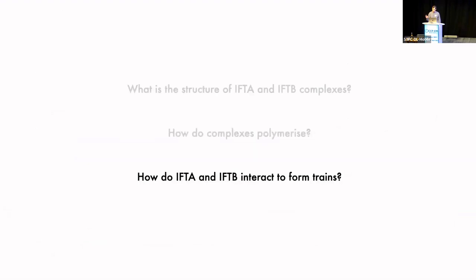Okay, so that is sort of what we're thinking about with regards to polymerization. And then the last question I want to come to is, how do IFTA and IFTB polymers interact with each other?